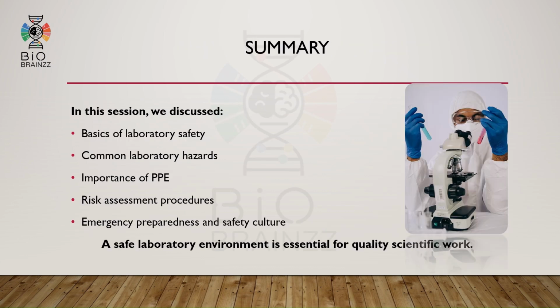So, let us summarize today's session. Today, we discussed basics of laboratory safety, common laboratory hazards, PPE, safe laboratory practices, risk assessment procedures, chemical and biological safety, emergency preparedness, and safety culture. Overall, laboratory safety is essential for quality scientific work and protection of personnel.